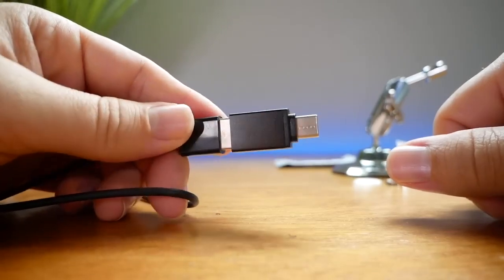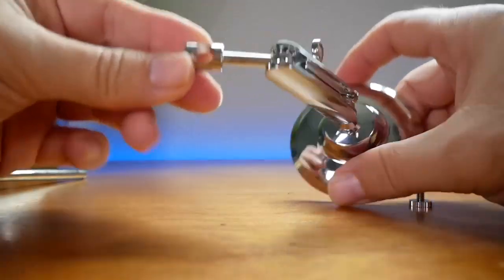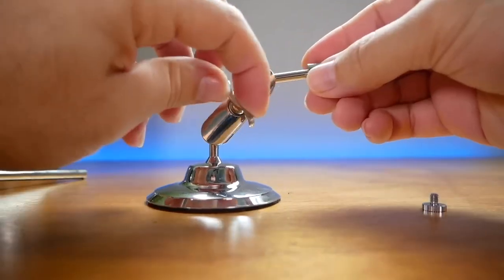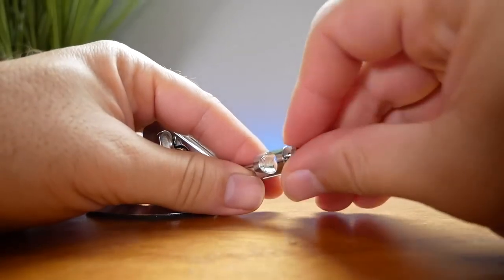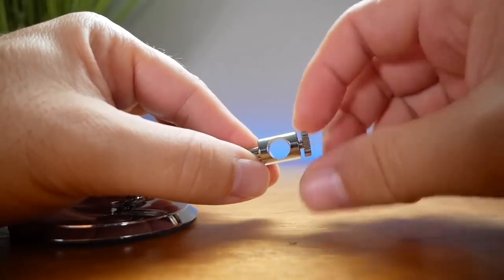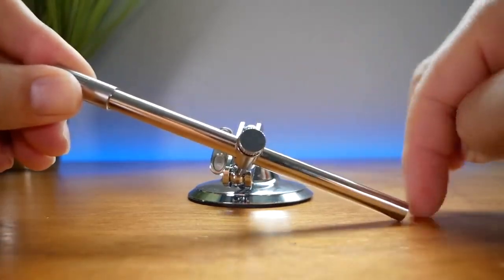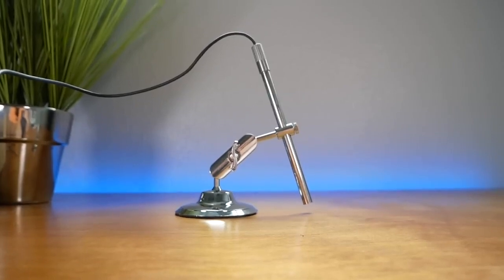Let's try to put the scope in the stand they include. It's a very nice stand — the scope goes in here and you can adjust it wherever you want by loosening this and then tightening it exactly in the position you want. The screw that was included threads into the top and that's what keeps the scope from turning or moving around. We just slide it in and leave it about right here.